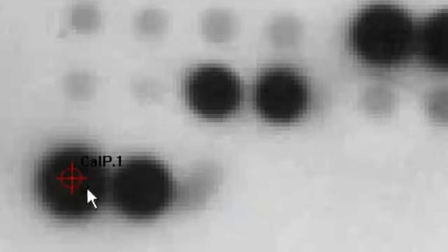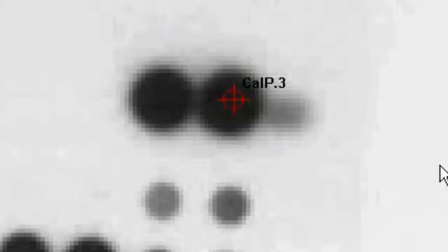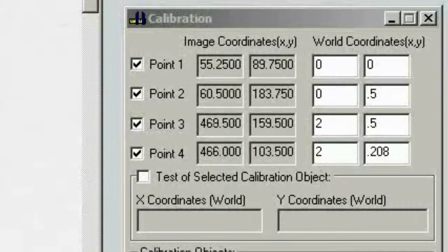We're going to zoom up to about 4 times and notice that the point is not truly centered. Using the arrow keys, we're going to center it up a little bit better. Hitting the Tab button with the viewport active brings us to the next point, and we center that up as well. You will notice that the image coordinates in the calibration tool also change when you move the ROI on the screen. We continue to the third and fourth points, using the arrow keys to center each one.